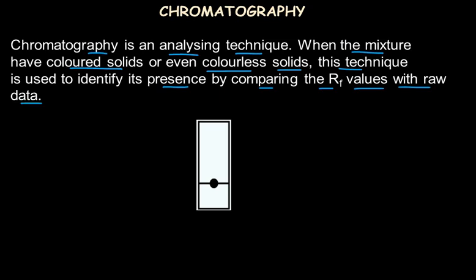Now let's understand what is chromatography in detail. For that, we need a chromatogram, or you can say a chromatography paper. Chromatogram is also called it as. Now chromatography paper is a kind of filter paper which can absorb solvents. So such a paper is taken.